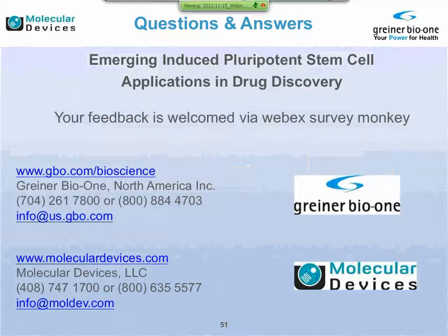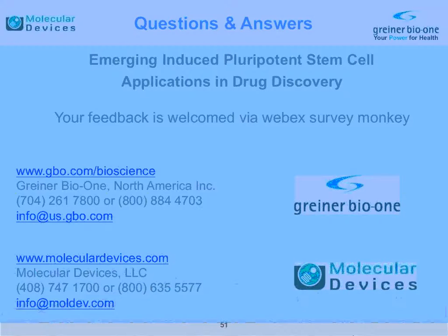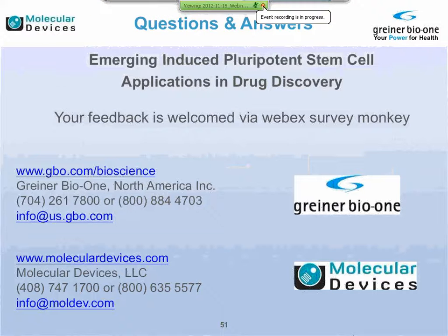And the live-based assay is just an example. It's a very simple approach. However, the data and the results you get from the iPS are much more detailed, going further into details, and more interesting. So maybe it's a kind of second screening assay, but a complete replacement, I would not say. It's still the classic high-throughput screening that has its place in drug discovery.